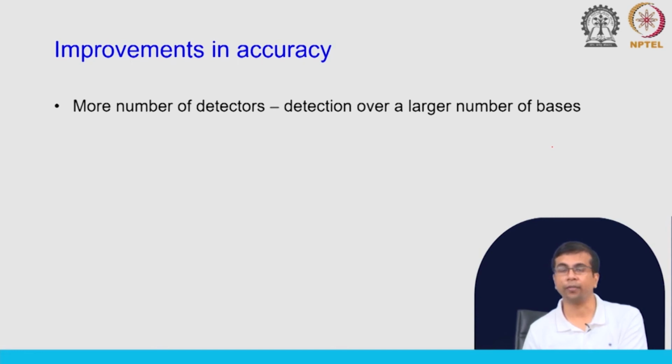You can imagine you have the flow cell, you have these nanopores, and each nanopore had only one detector. Now, there are two detectors, slightly separated from each other, which detect the change in current. So, they are affected by a larger combination of bases. As you increase the uniqueness of the bases, you can get better correlation with the signal change or the current change that is happening. So, more detectors lead to higher accuracy.